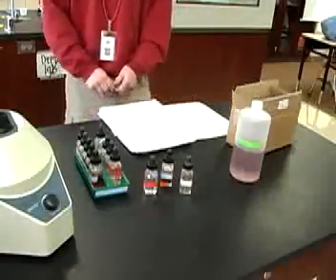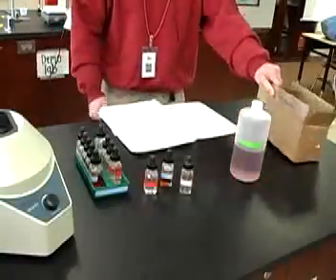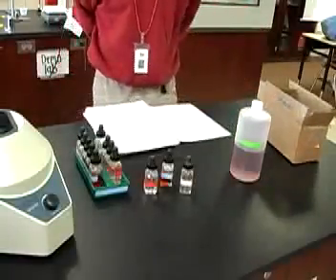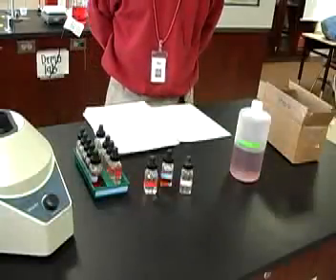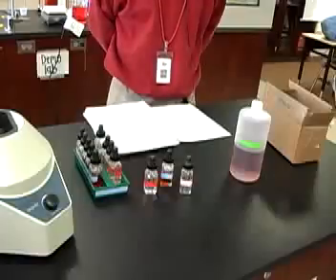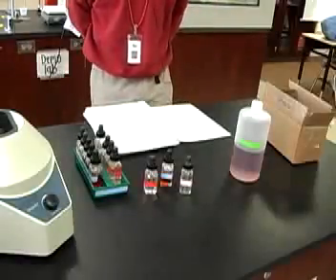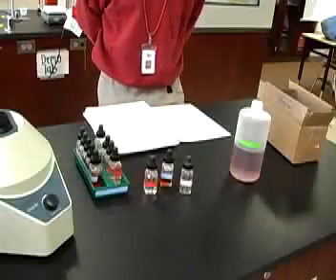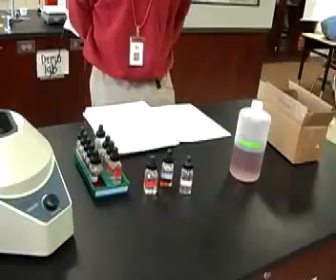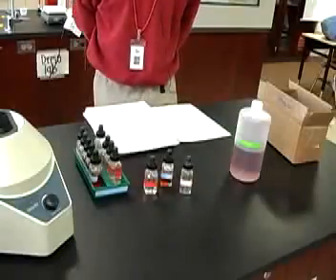Okay, we're on the second page now on the topic called avoiding contamination. Tap water is often a source of contaminating ions. Wash all glassware and rinse it with distilled water. A stirring rod is constantly used to mix solutions, and it must be rinsed with distilled water so it does not contaminate subsequent solutions. An easy way to do this is to fill a 400 milliliter beaker about 2/3 full of distilled water and keep your stirring rod in this beaker.